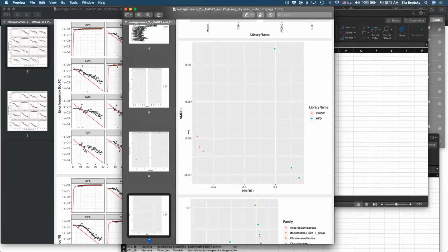So how many reads do I have in this particular segment? The reads are not going to be too short, because they only cover the hypervariable regions, which are already short. I know that the hypervariable regions vary between different families or species of bacteria, and that's how I can calculate the abundance. Does that make sense, Marcia?